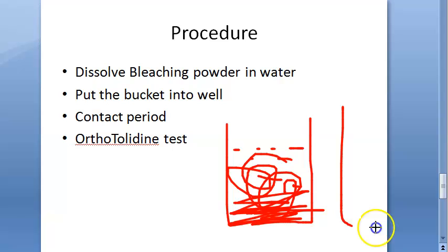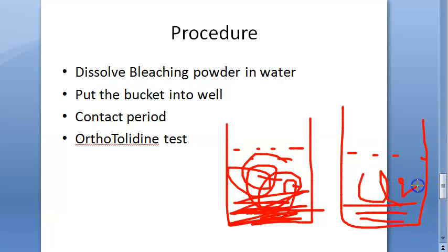So now you are allowing it to sediment. You will allow it to sediment for 5 to 10 minutes, till this settles down. The supernatant solution has the chlorine. Where will the chlorine be? The chlorine is in the supernatant solution, right?